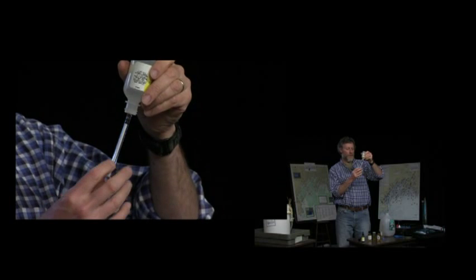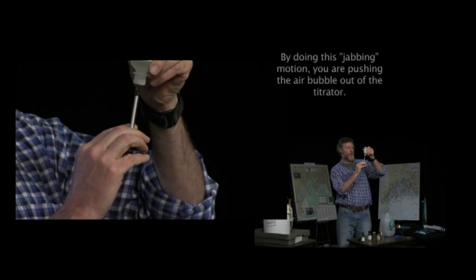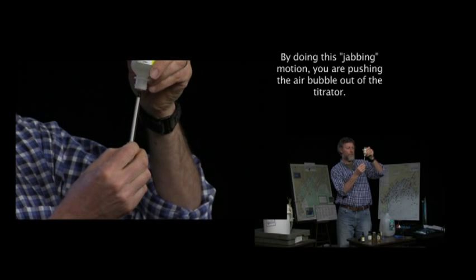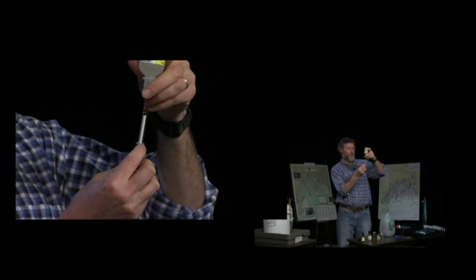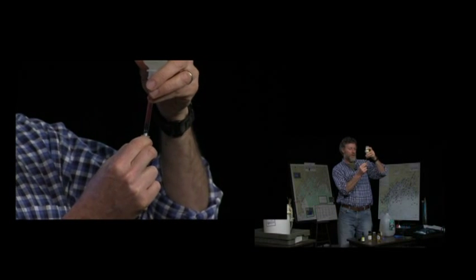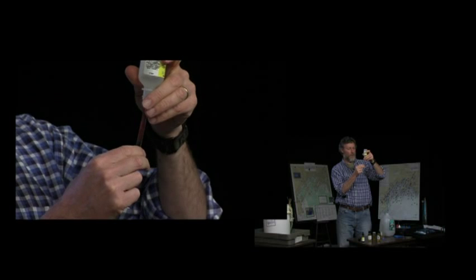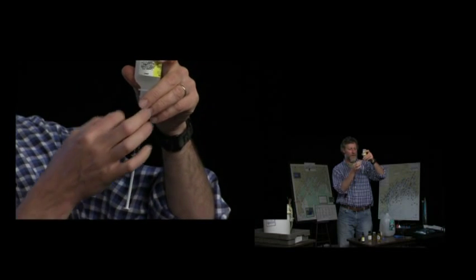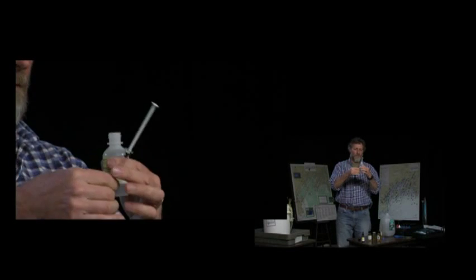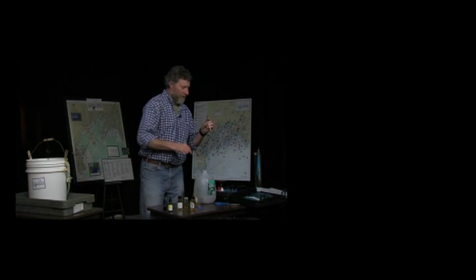Air bubbles can be a real problem. So if you take the syringe and give it a quick little jab or two or three, you can try to get rid of any air bubbles that might be in there. And then you want to pull the syringe down as far as you dare. Now I'm pulling it down way past the 0 mark, way past any of the markings, and I'll tell you about that in a minute. Pull it down as far as you dare, and then pull the syringe out. We'll put the cap back on, and put it back in.